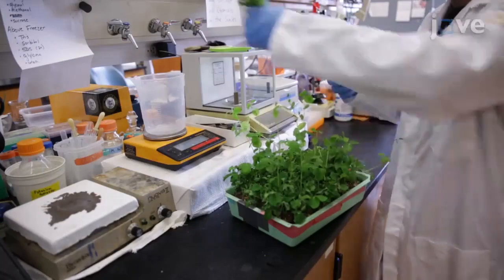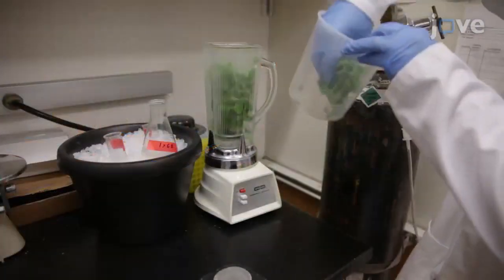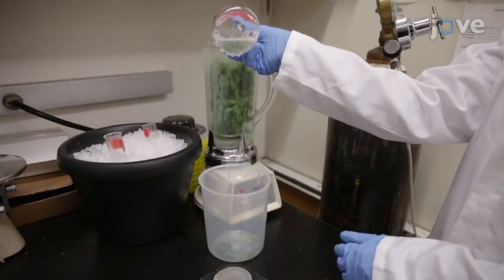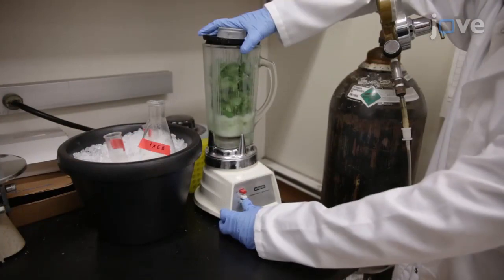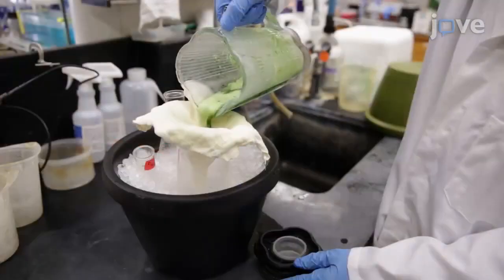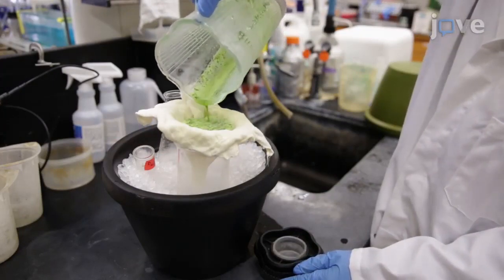Then harvest approximately 25 grams of 9 to 15-day-old pea shoots. Add them to 95 milliliters of cold 1xGB buffer in a chilled blender with sharpened blades and homogenize. Filter this mixture through a minimum of 2 layers of cheesecloth placed in a funnel over a chilled beaker.